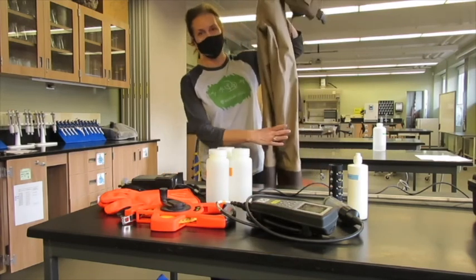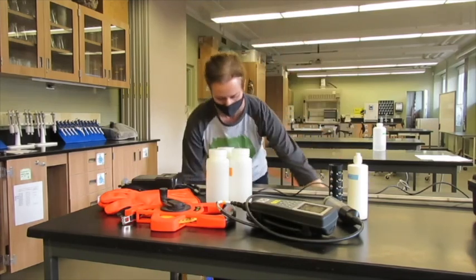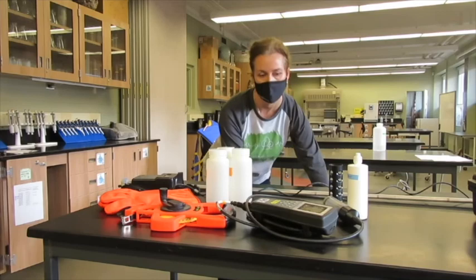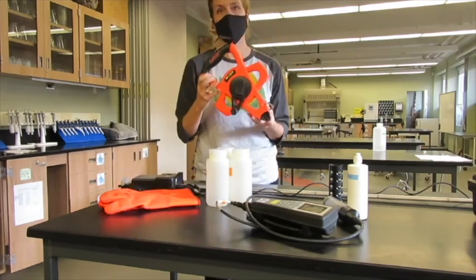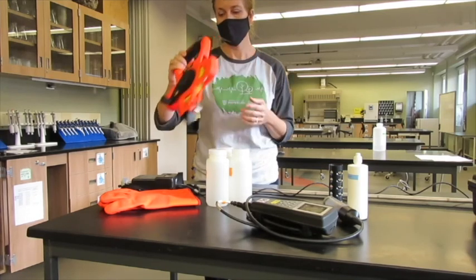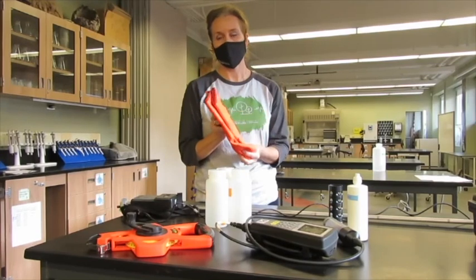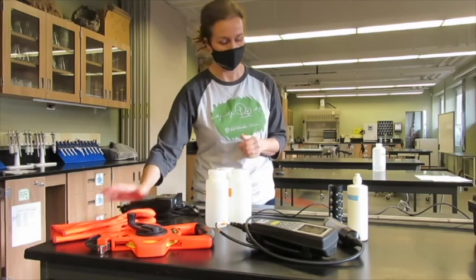First of all, we have our waders that we use, as well as a life jacket — that's always important when going out into the water. We have a measuring tape to measure both the wetted width and bankful width. During the winter months, the lab provides insulated rubber gloves to help you with handling the equipment.